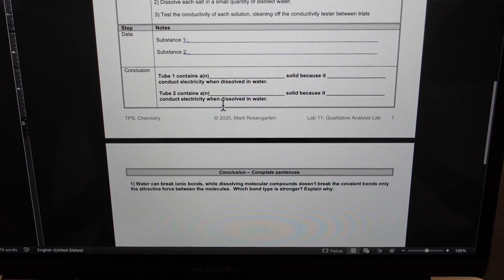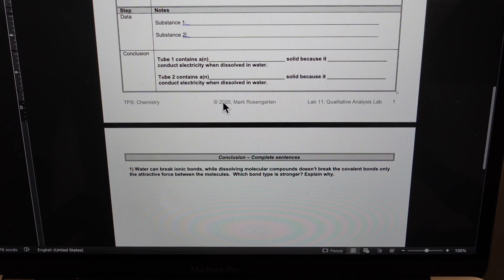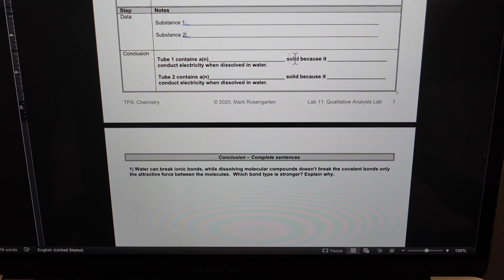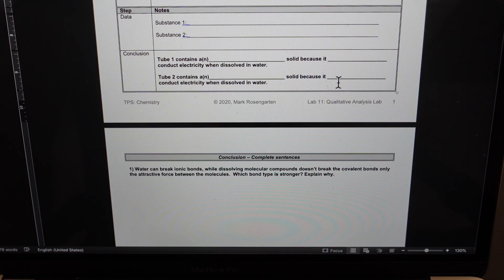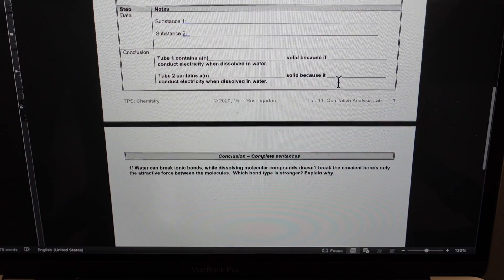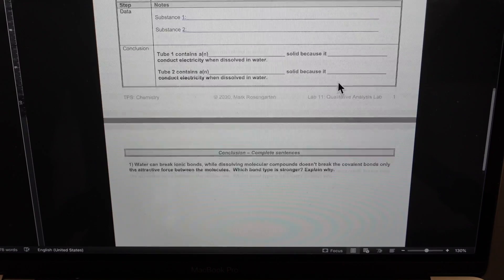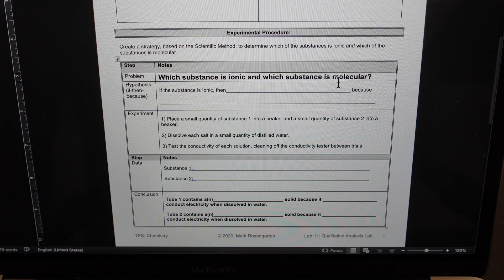And then make your conclusion. Does tube one have an ionic or molecular solid? Because it did or did not conduct electricity and the same with tube two. Once you've dealt with that, there's a couple of questions to finish it off and that is your entire lab. So let's get on to the procedure.